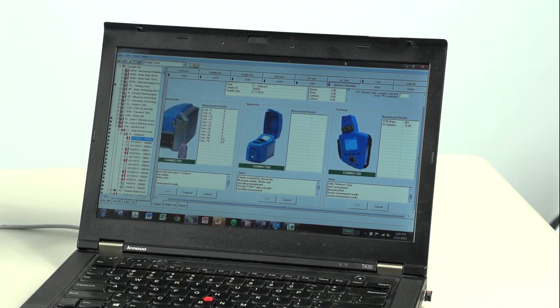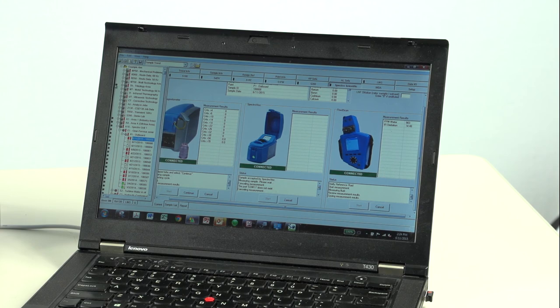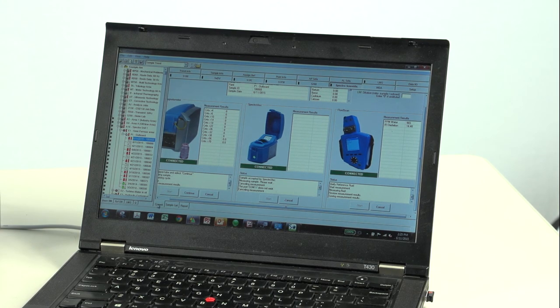From the database, one can look at sample results.